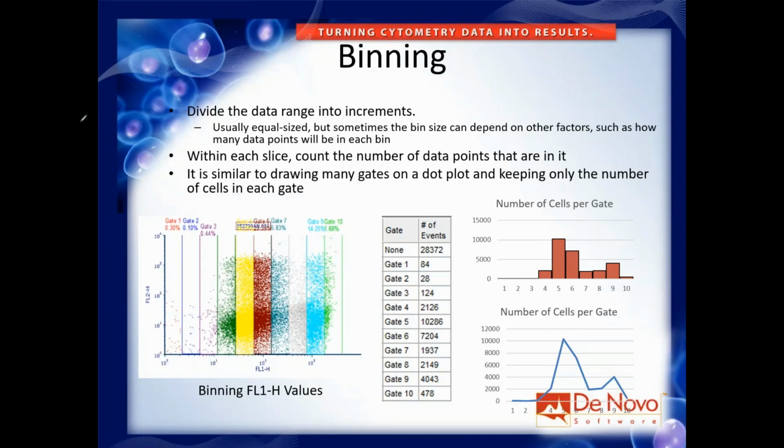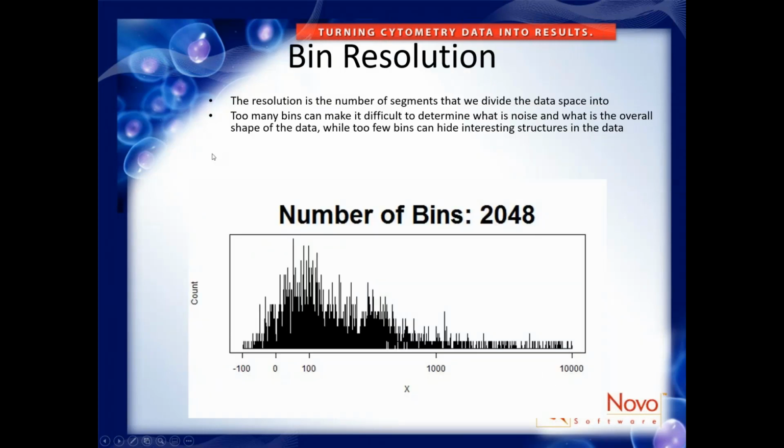To show you that the binning is very important, I hope this animation comes through. You need to match the binning to your data. This is a first sort of arbitrary choice that you need to make. If you bin your data into too many bins, you can't see the structure of your data. And if you bin it into too few bins, again, you can't see the structure either. Here's a little animation that I hope comes across in the GoToMeeting.